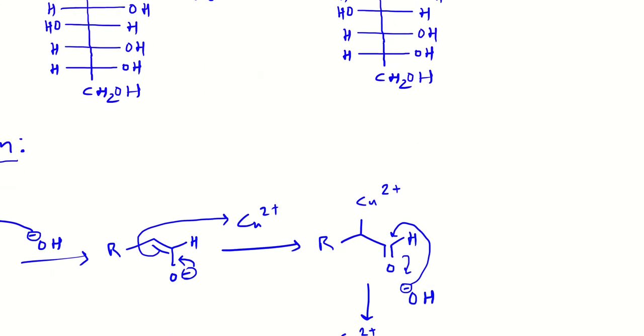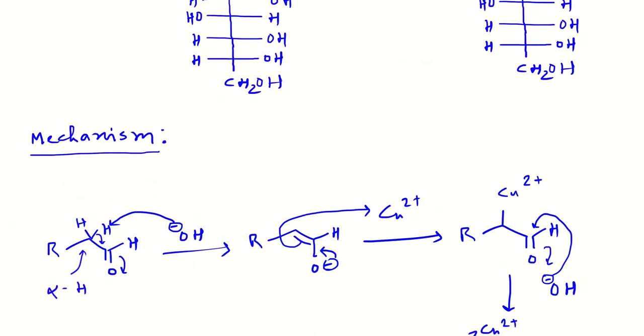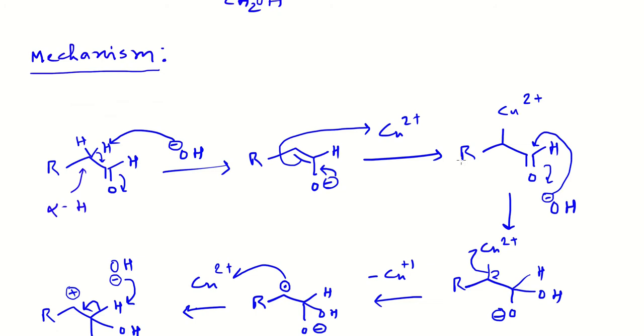So what is the reaction mechanism? The mechanism is basically the same as Fehling's reaction. It is actually a modification of Fehling's reagent, since after mixing Fehling A and Fehling B, the Fehling reagent is unstable and cannot be stored for the long term. So that's why the sodium potassium tartrate is replaced by the sodium citrate salt, and the Benedict reagent or solution can be stored for a long time. That is why Benedict's reagent is used much more frequently than Fehling's reagent.